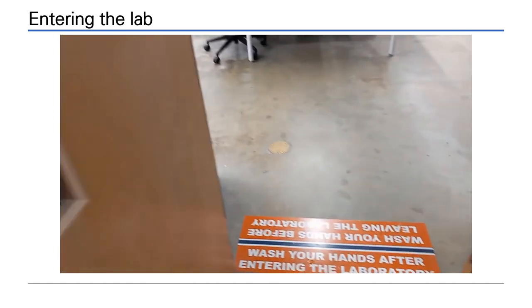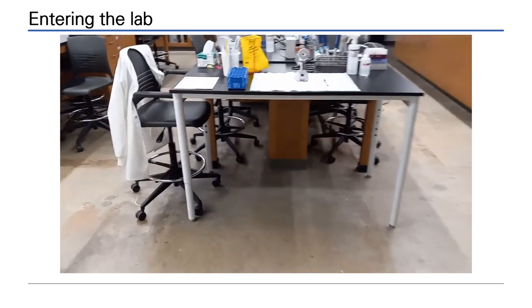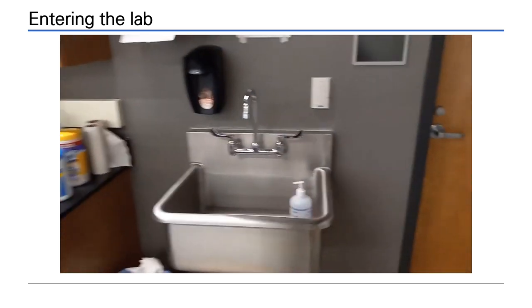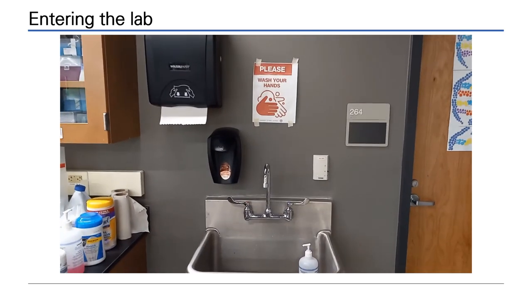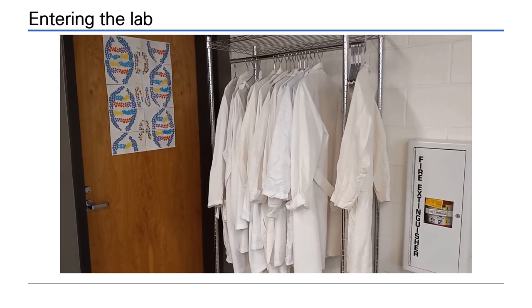As you enter, you're reminded to wash your hands before starting work. Only use the designated hand washing sinks and wash your hands for 20 seconds. Lab coats and aprons are also used to protect your clothing.